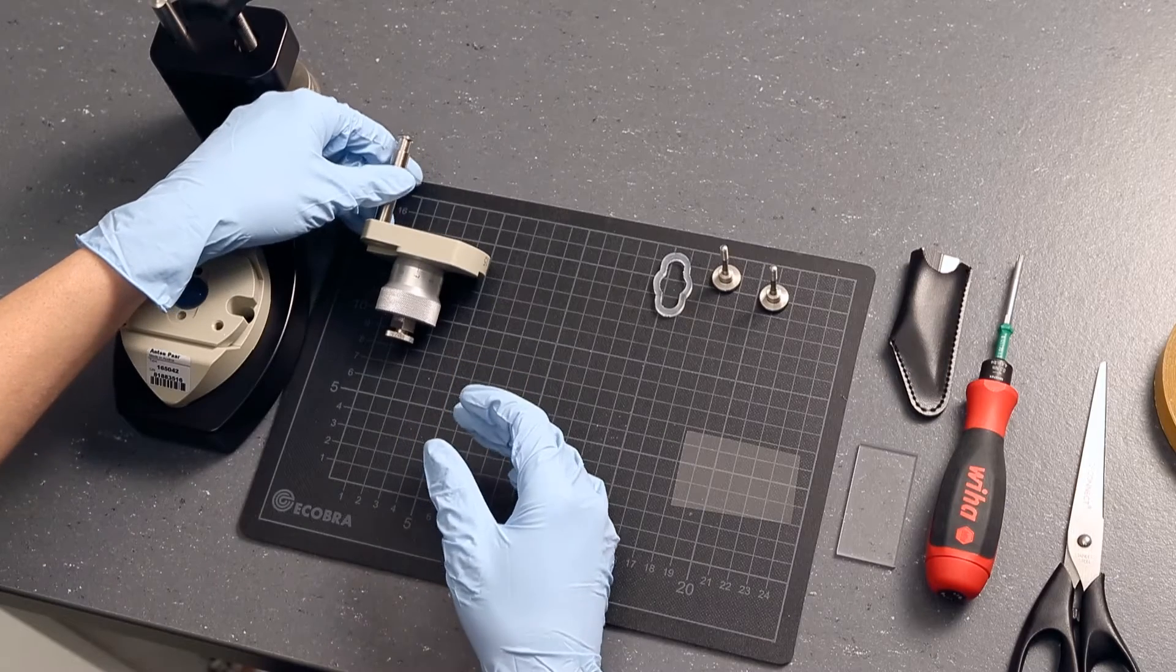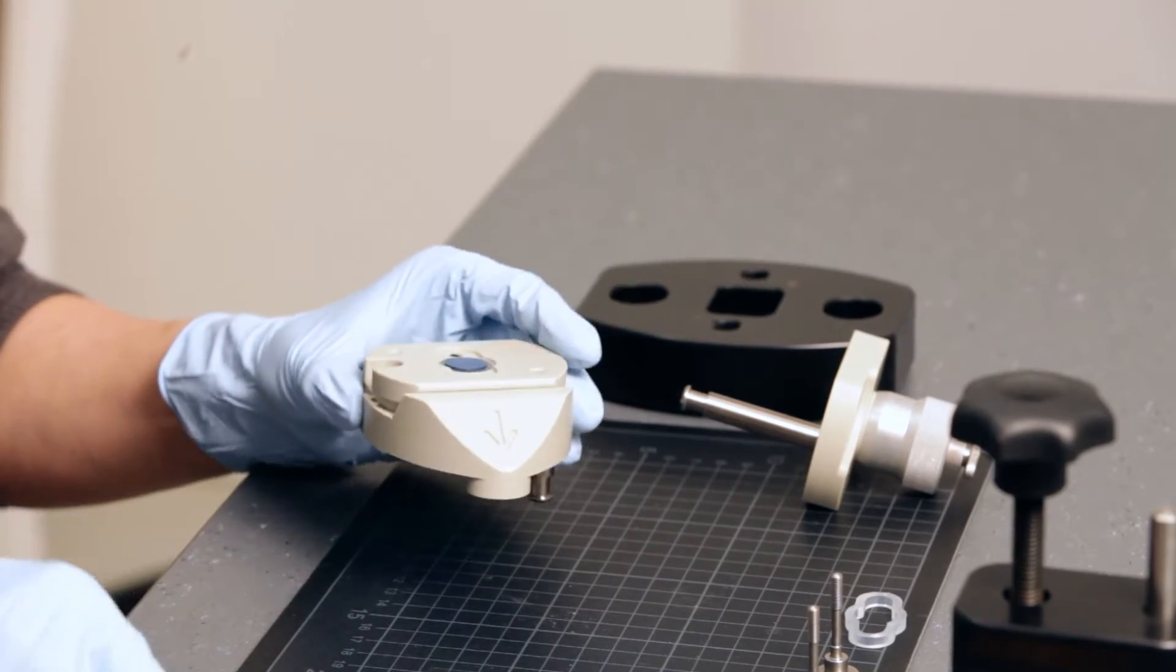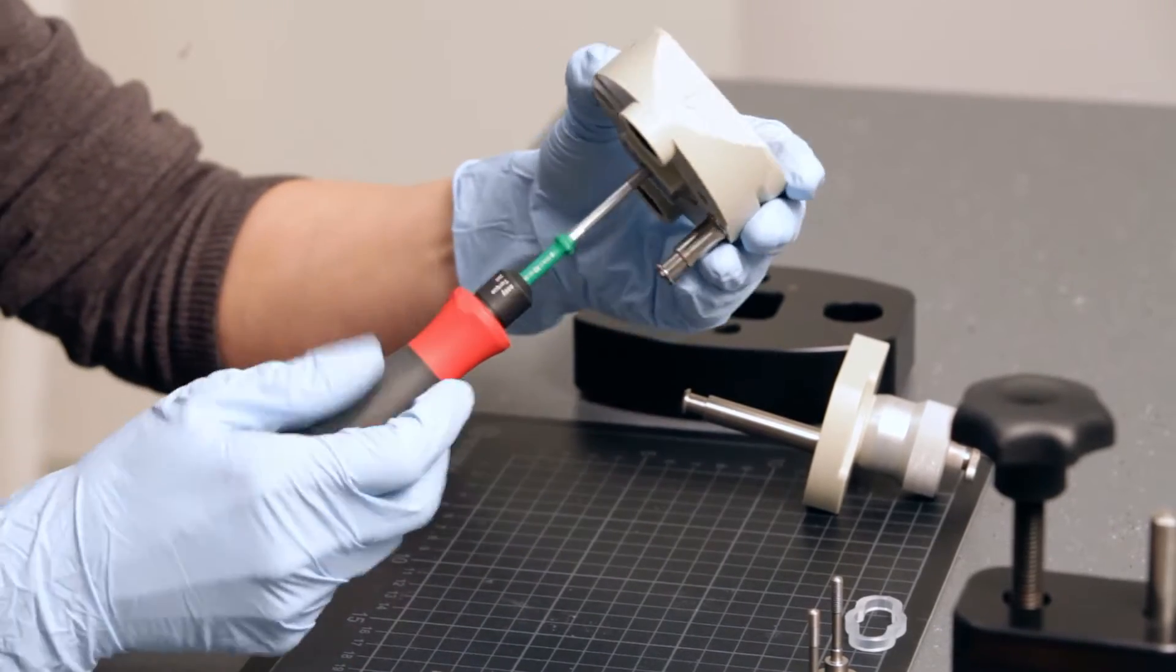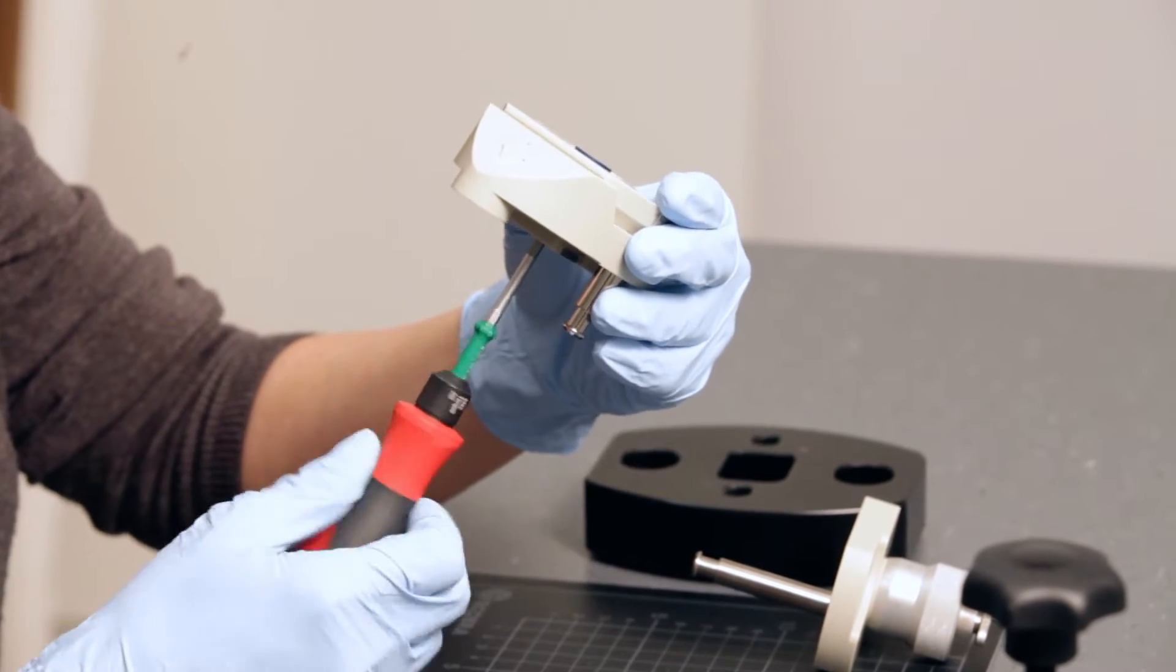Now remove the sample holders of both parts of the cell. Use the Torx T20 screwdriver to push the sample holder out of the lower part of the cell.